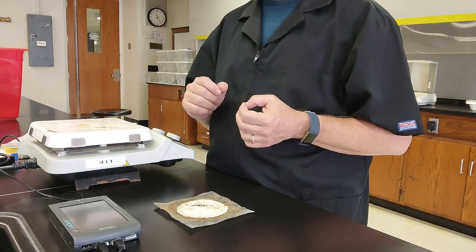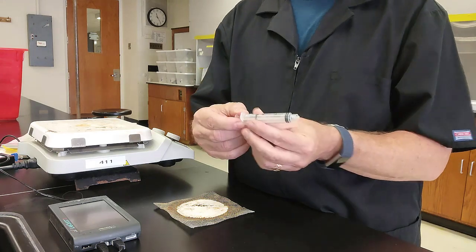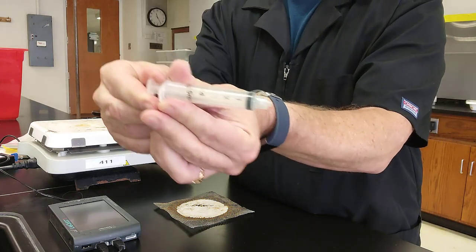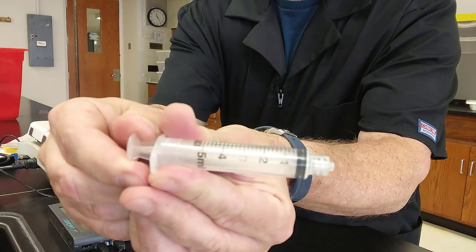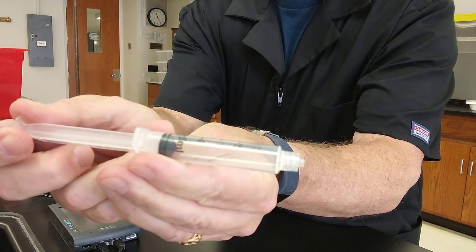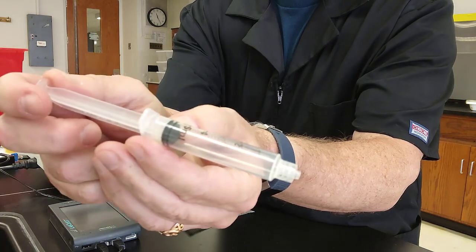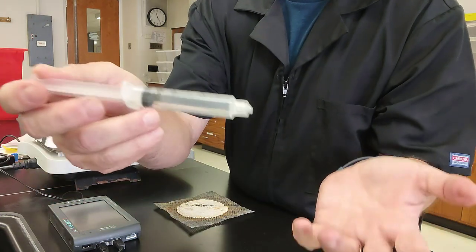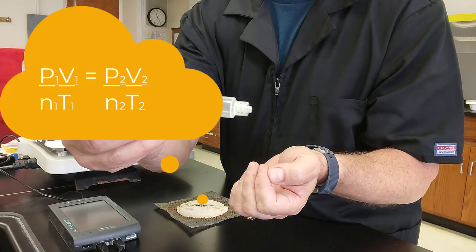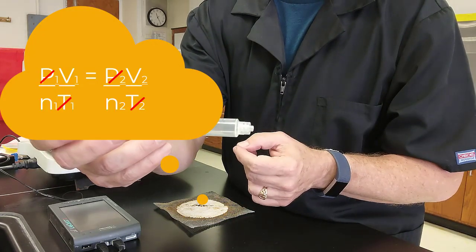We're not going to look at Avogadro's law, although I'm sure you'll agree that if I have no gas in this syringe, and then I suck some gas into the syringe, now there is more gas in there and it takes up more space, which is the genius of Avogadro's law. No experiment necessary. If you have more gas, it takes up more space.